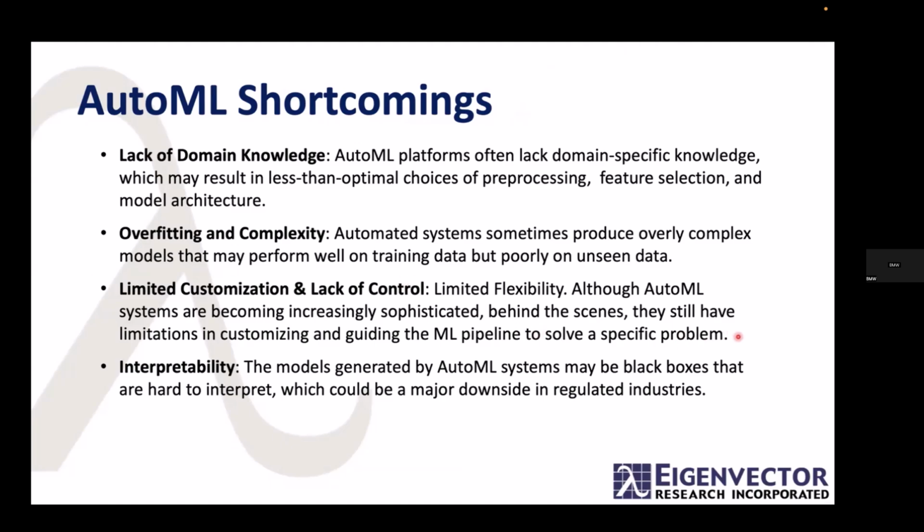They often don't work very well on unseen data, and there are limited opportunities for customization and a lack of control. They're becoming increasingly sophisticated, but still have limitations in guiding the pipeline to solve a specific problem.